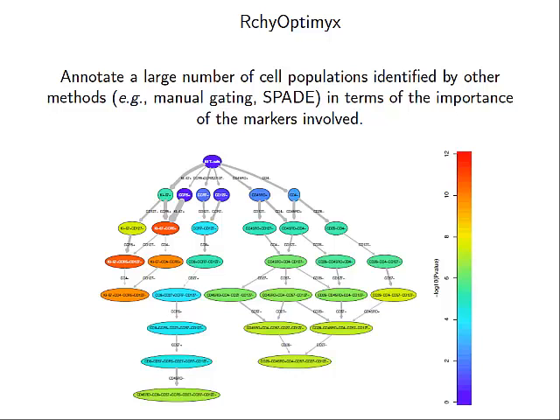It also depends on how big the proportion change is between group one and group two. So if all your sick people are going to die because 20% of the cells have this, and everybody else is at 21, and if everybody has that, if you have enough patients, you can get a p-value out of that that's going to be significant. If you look at 1,000 patients, everybody in group 1 has less than 20, everyone in group 2 has 21 to 23, you get a very small p-value from that.